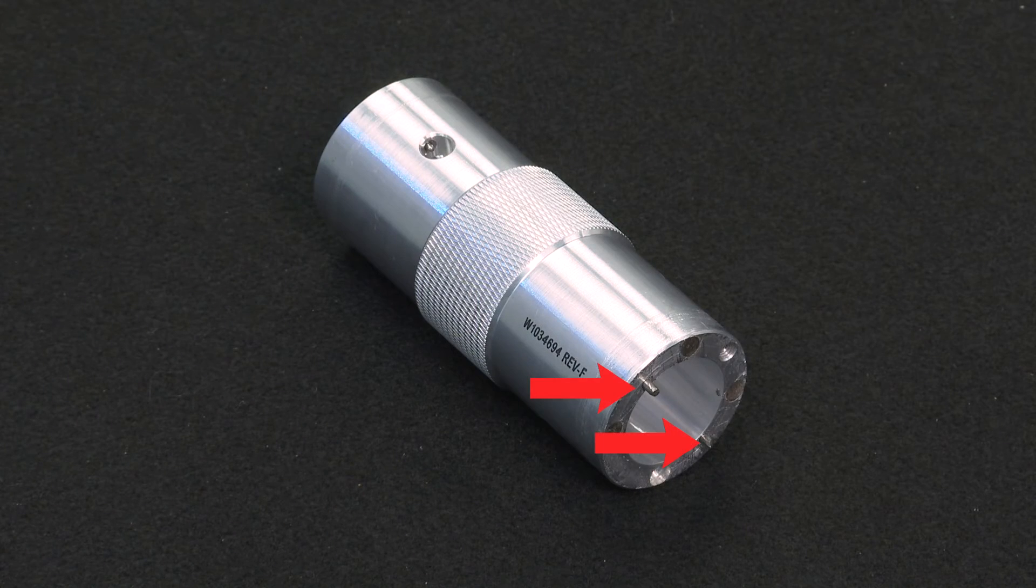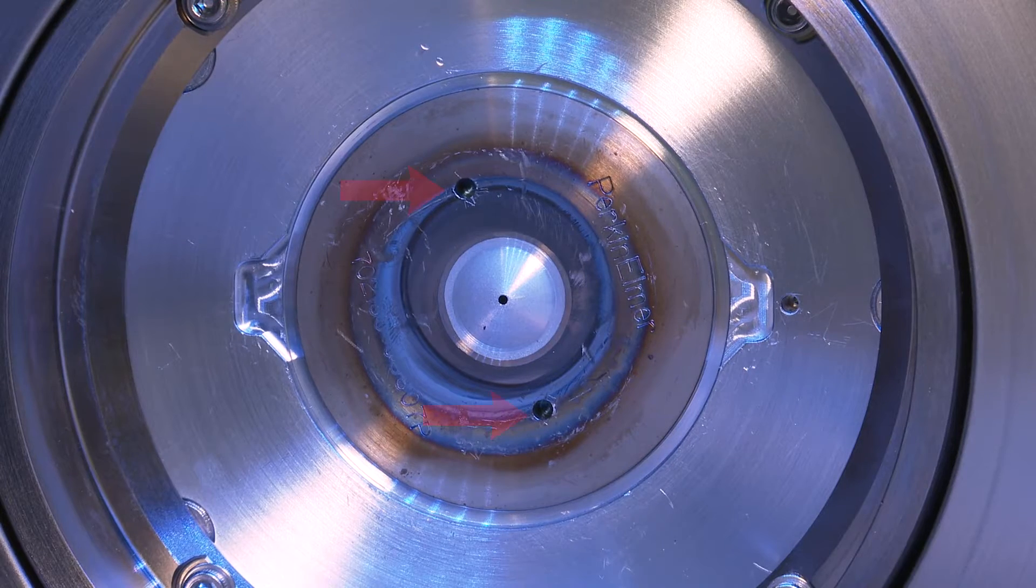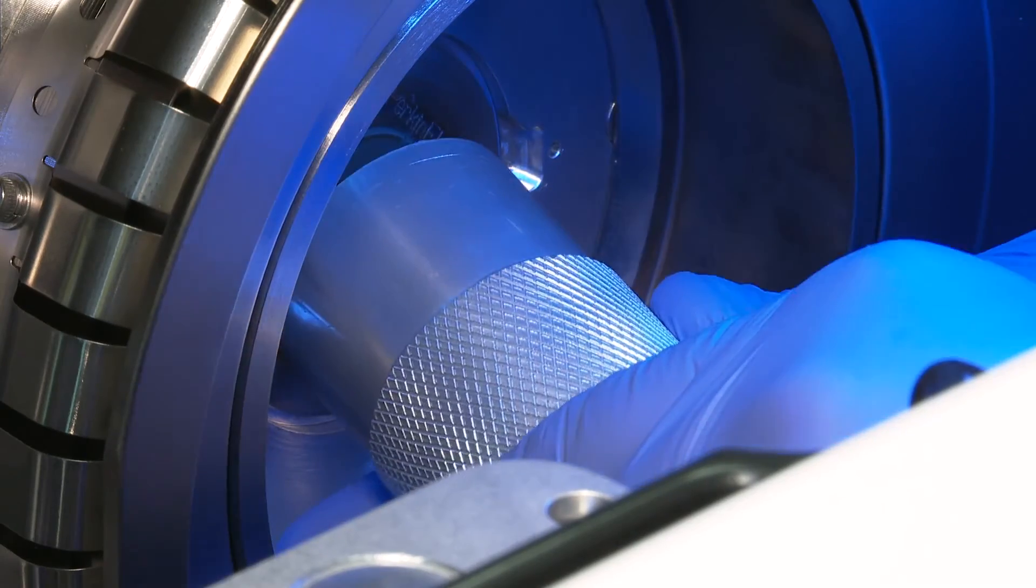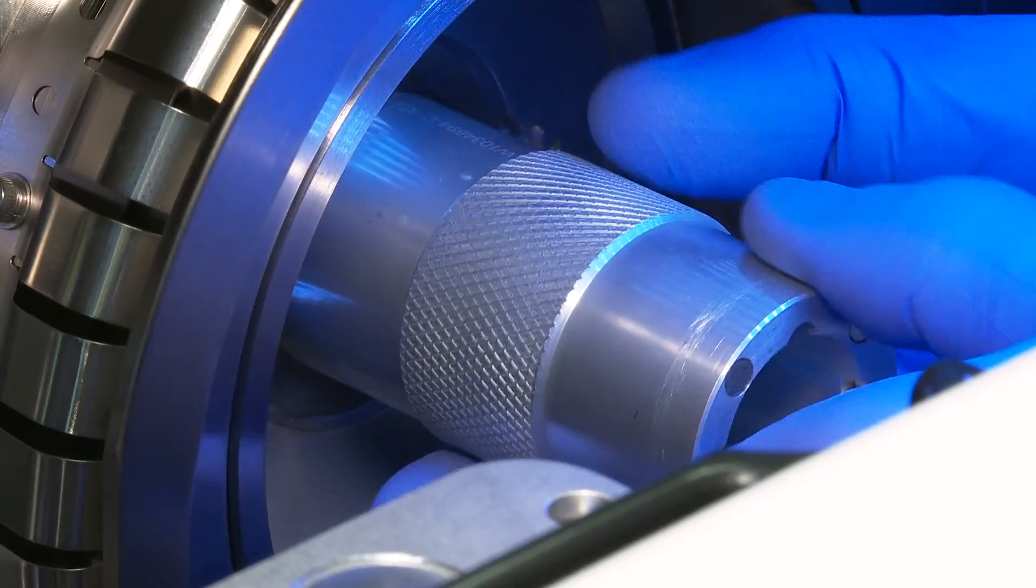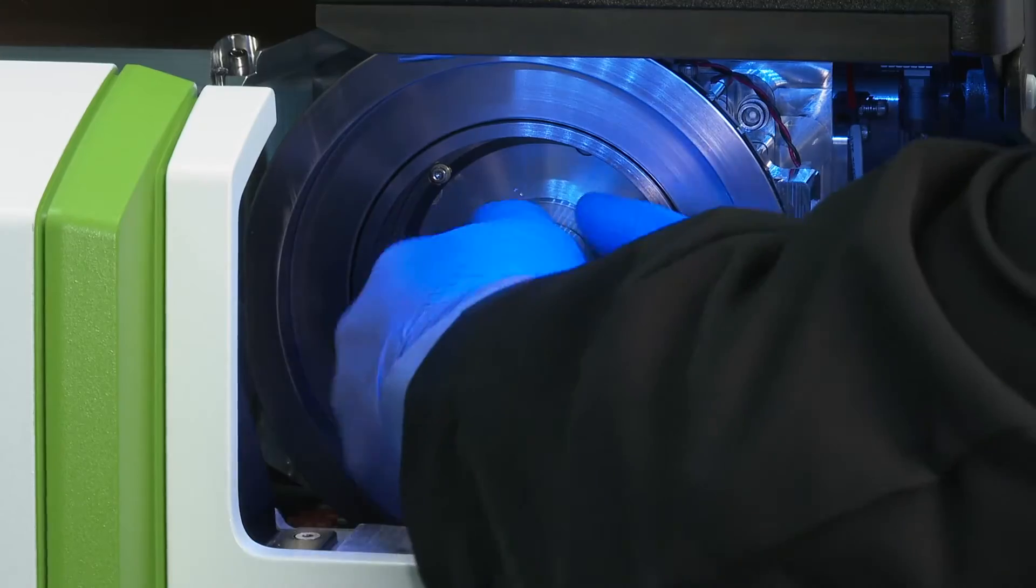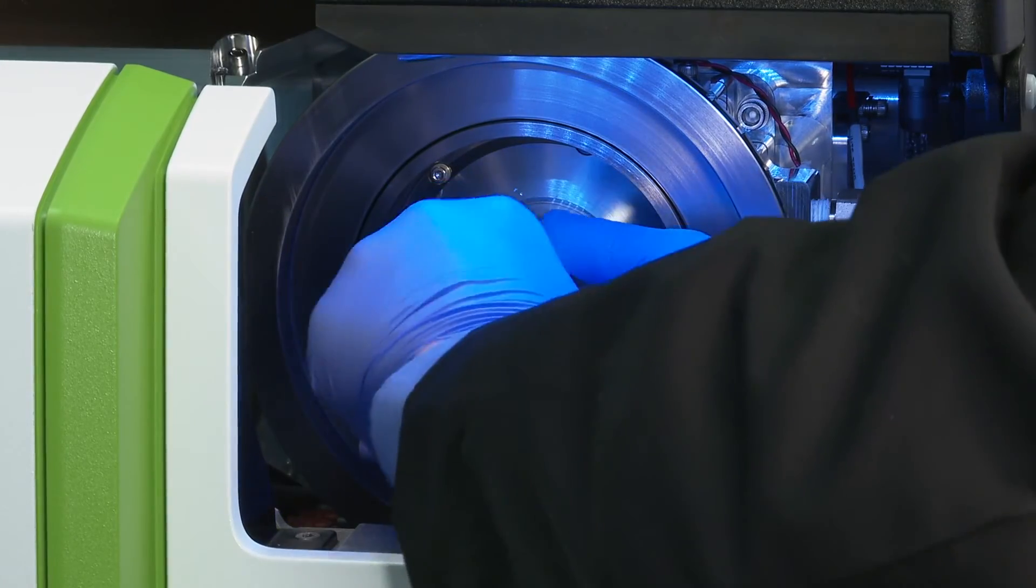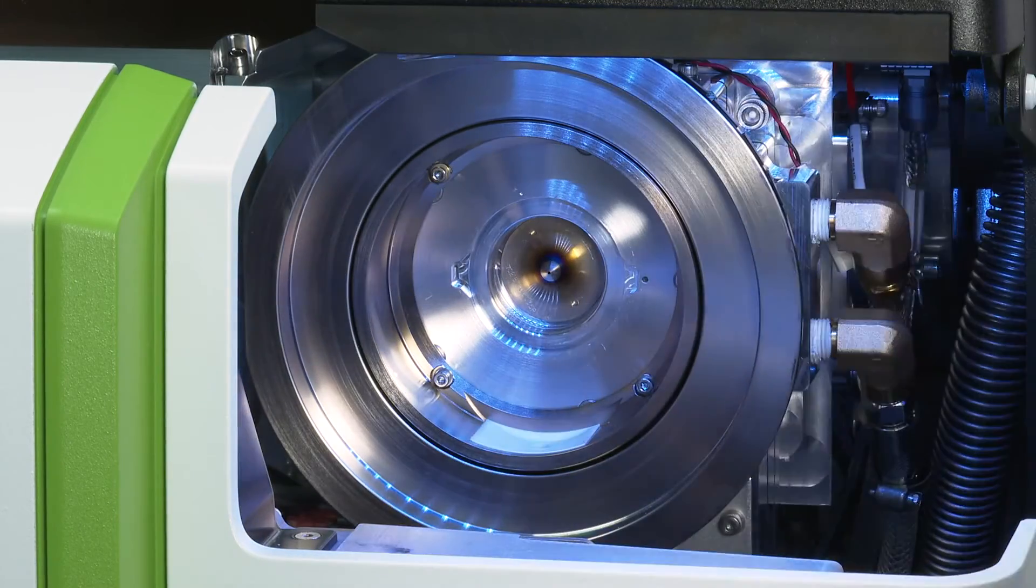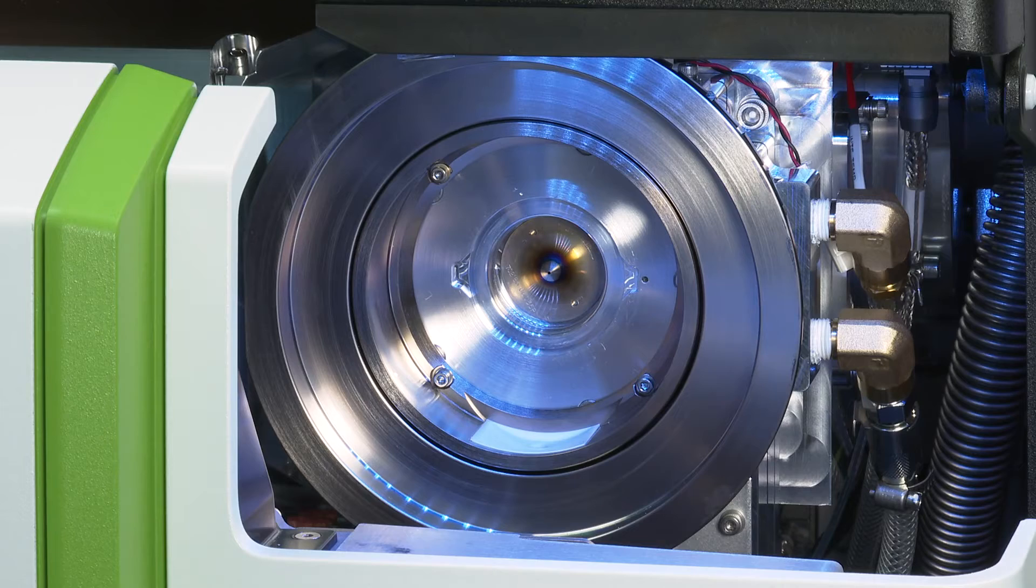Next, insert the pins on the cone removal tool into the holes on the sampler cone. Once the pins have engaged, the magnets will secure the cone to the tool. Unscrew the sampler cone by turning it counterclockwise. Place it on a clean working area and always handle cones by their edges.